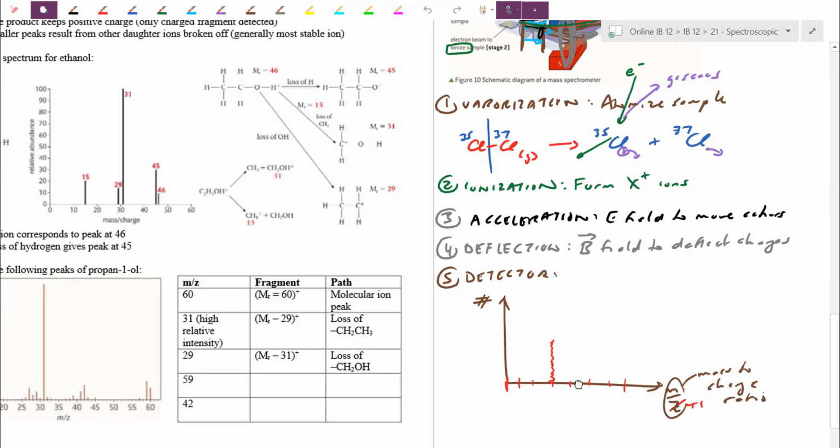So we actually just do this nice scan here, and we get many different hits. This one actually tells us the different isotopes that we have, and also the heights, the areas under the curves actually tell us the abundance. So that's actually how it looks here.